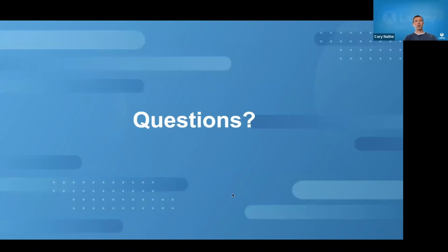Excellent, thank you, Rosalind. There's one more question, and we'll see if some others trickle in here at the end as well. One question that was just at the end of the demo question section was what LabKey entity you were using to put things in. I'm assuming by entity there, like data structure. So in this case, Rosalind, I believe is entirely using lists, so LabKey lists, just as a general table structure for demo purposes here.